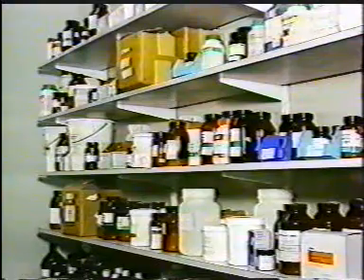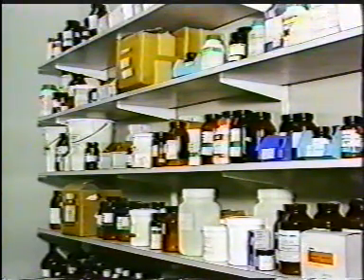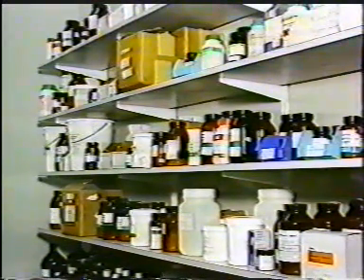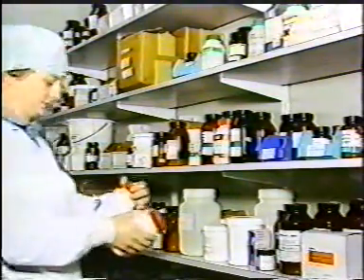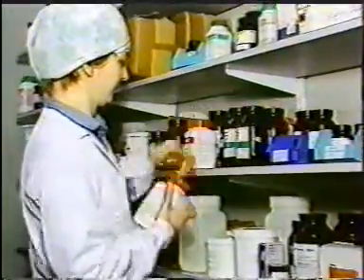Once the raw material has been released, it is essential to ensure that the quality of the material is maintained. The storage conditions must be suitable, and a proper system of stock control and rotation must be employed so that old stock does not accumulate, for example, at the back of shelves.